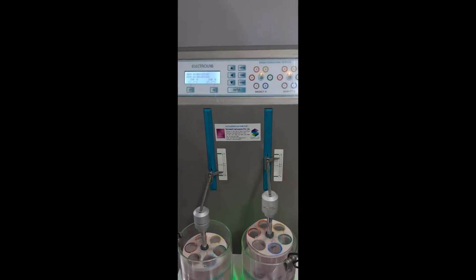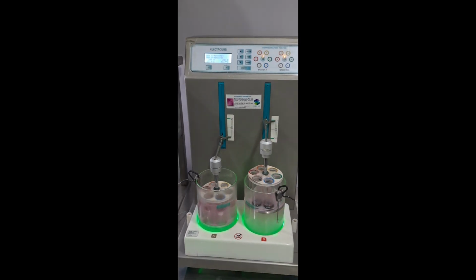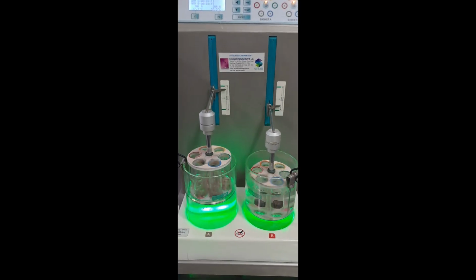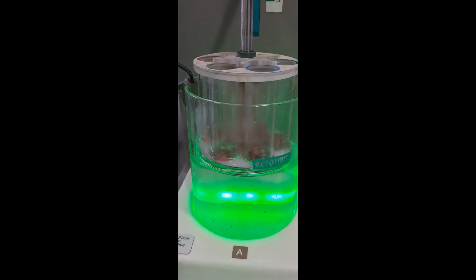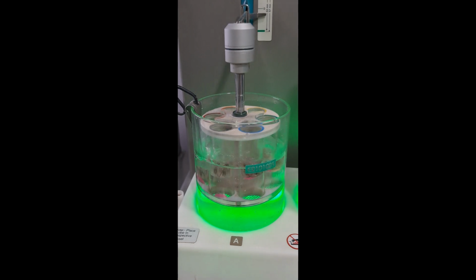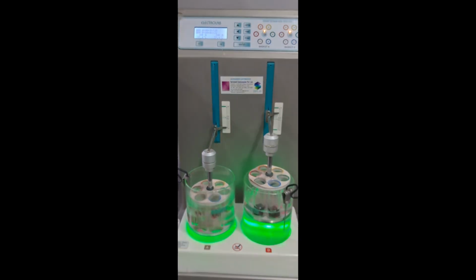7. Validation and qualification. Perform installation (IQ), operational (OQ), and performance (PQ) qualifications on new or relocated units. Requalify after any major repair or at defined intervals.